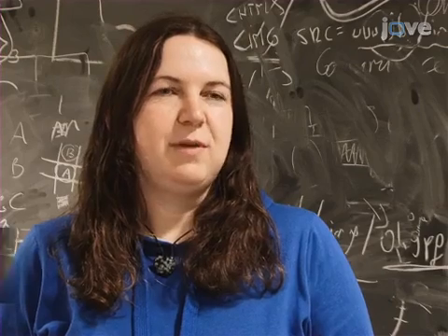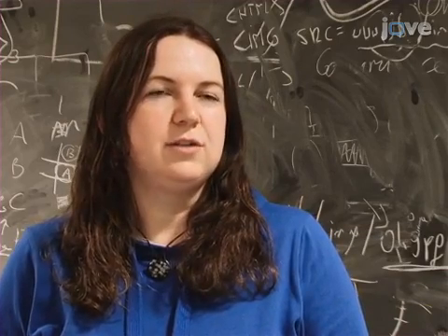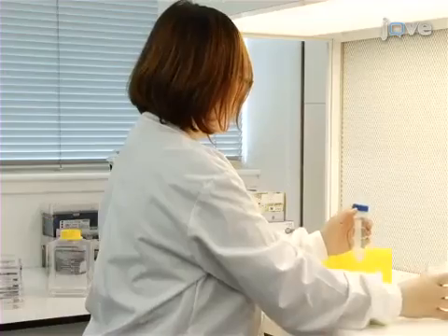Visual demonstration of this method is critical because although the individual steps appear rather simple, proper handling of the cells and an efficient workflow are essential for obtaining a good result. Parts of this procedure will be demonstrated by Katalin, a research assistant from our laboratory.